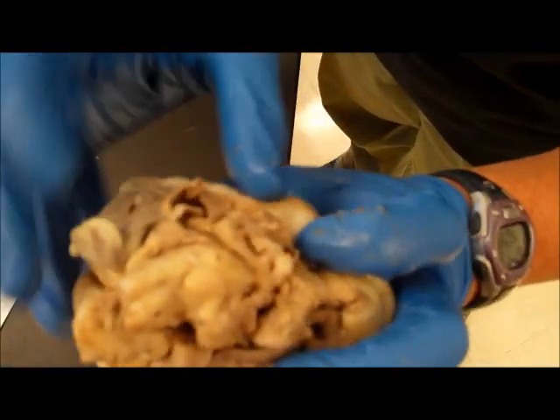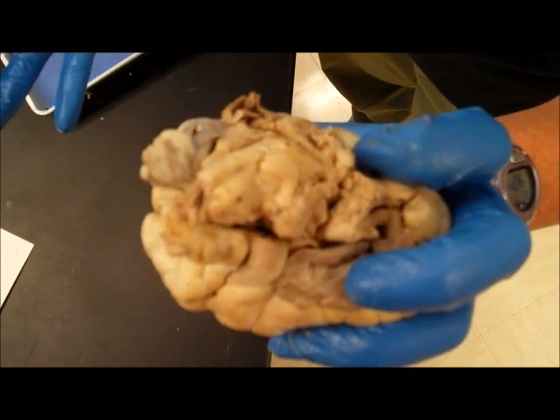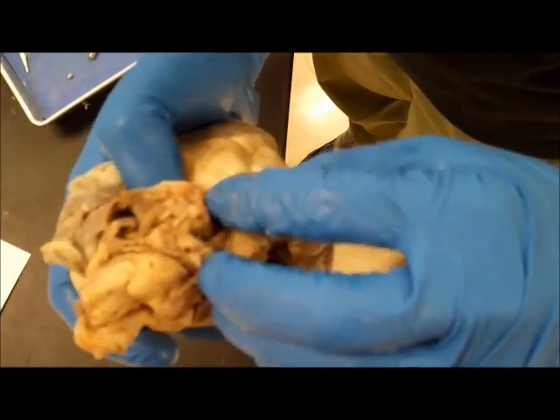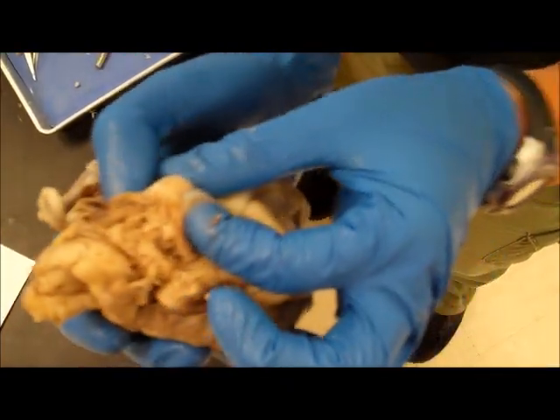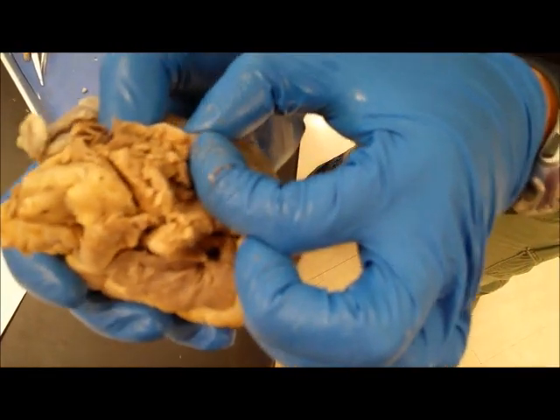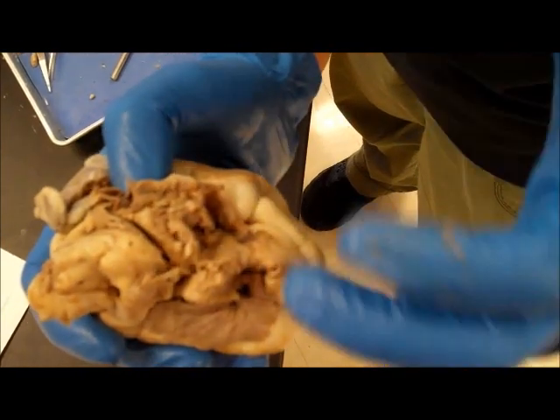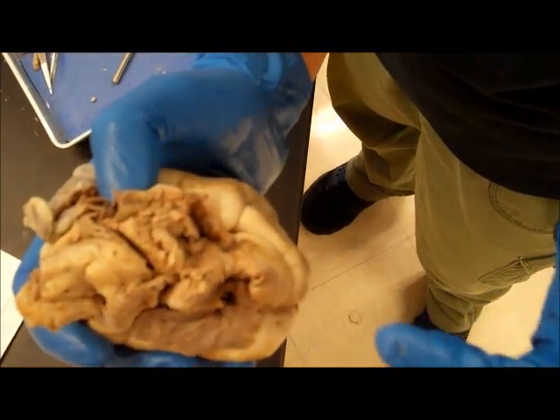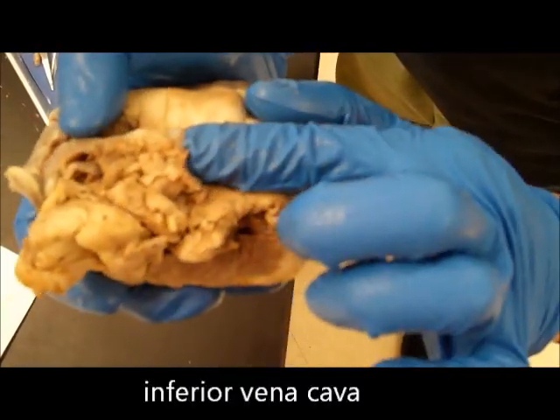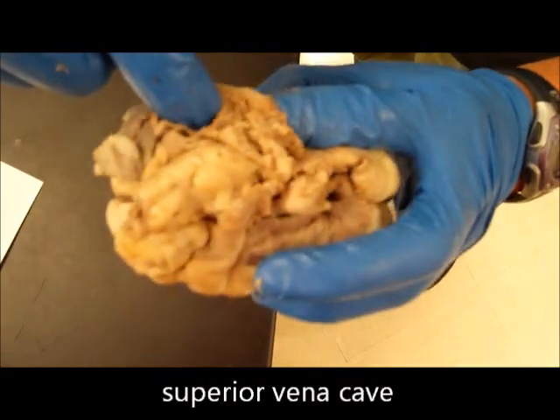So the blood is going to be carried from the lower body and pass through this vessel here, which has been cut when this heart was removed from the sheep. So depending upon how it was dissected out of your sheep, you may or may not be able to locate this easily. So we have our inferior vena cava, and here we have our superior vena cava.